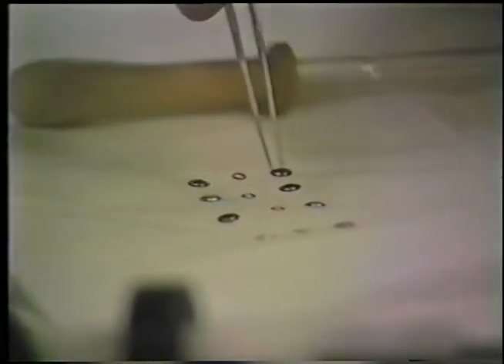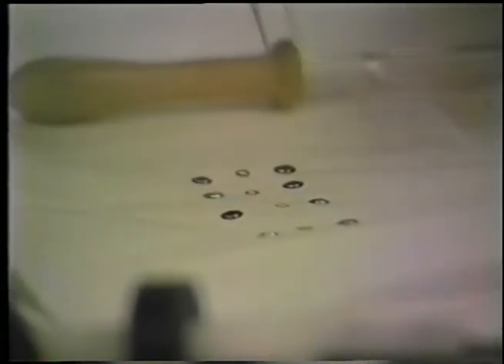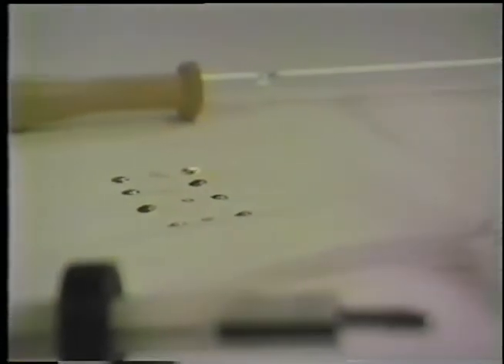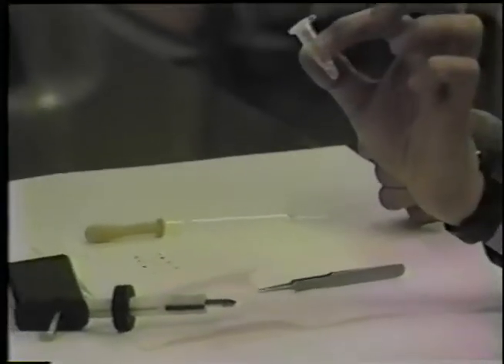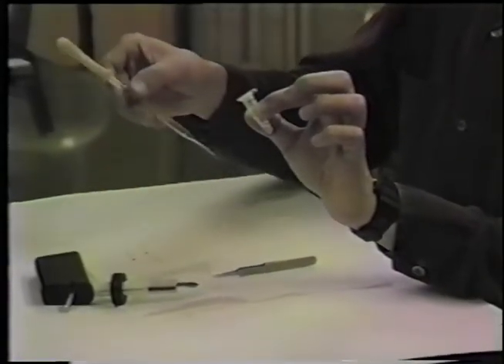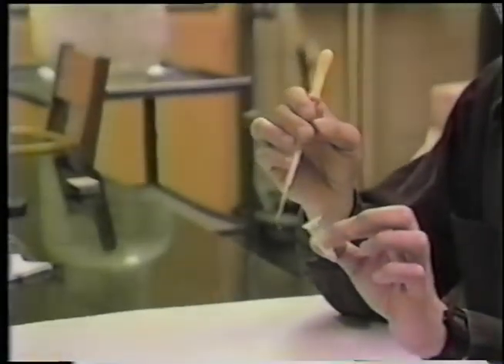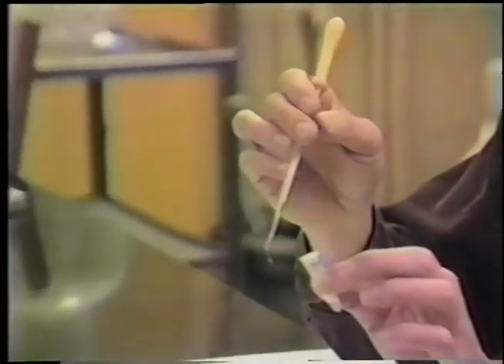In between those rows of specimen carriers is a row of gold EM slot grids, which we're using as spacers for this particular sample. The spacer serves to keep the sample from being crushed into oblivion between the metal carriers. We also have the sample, which has been spun down into a tight pellet, and a Pasteur pipette, which has been pulled out into a relatively fine angled tip for transferring the specimen from the centrifuge tube to the metal specimen carrier.